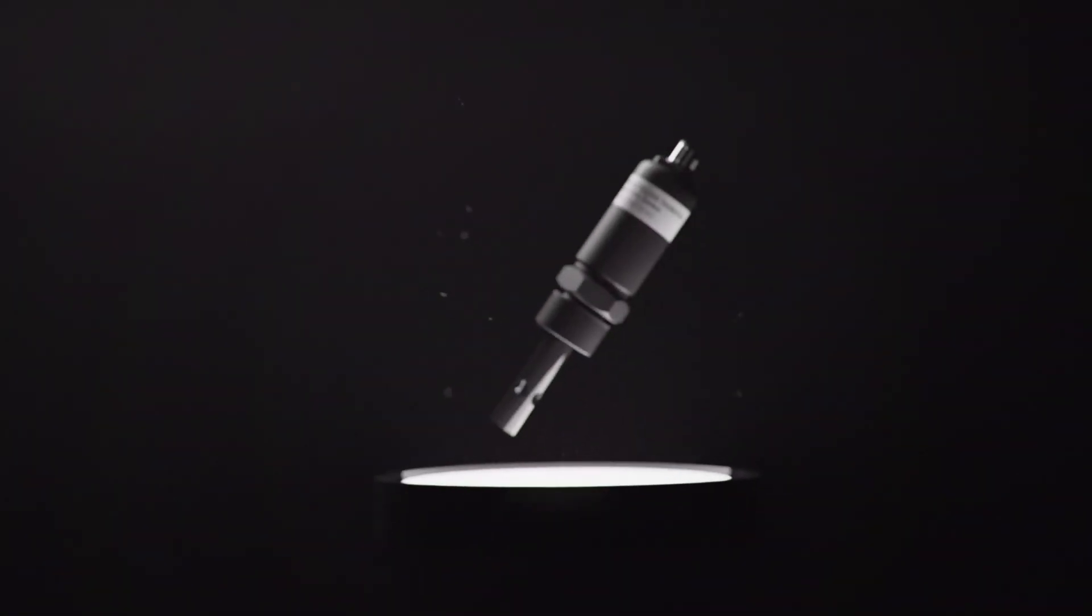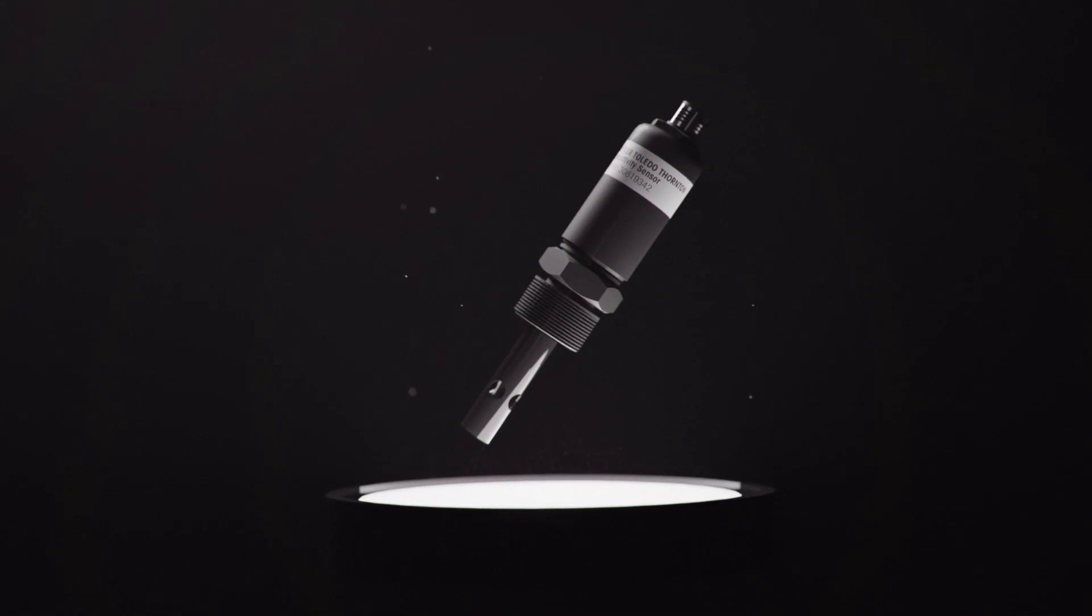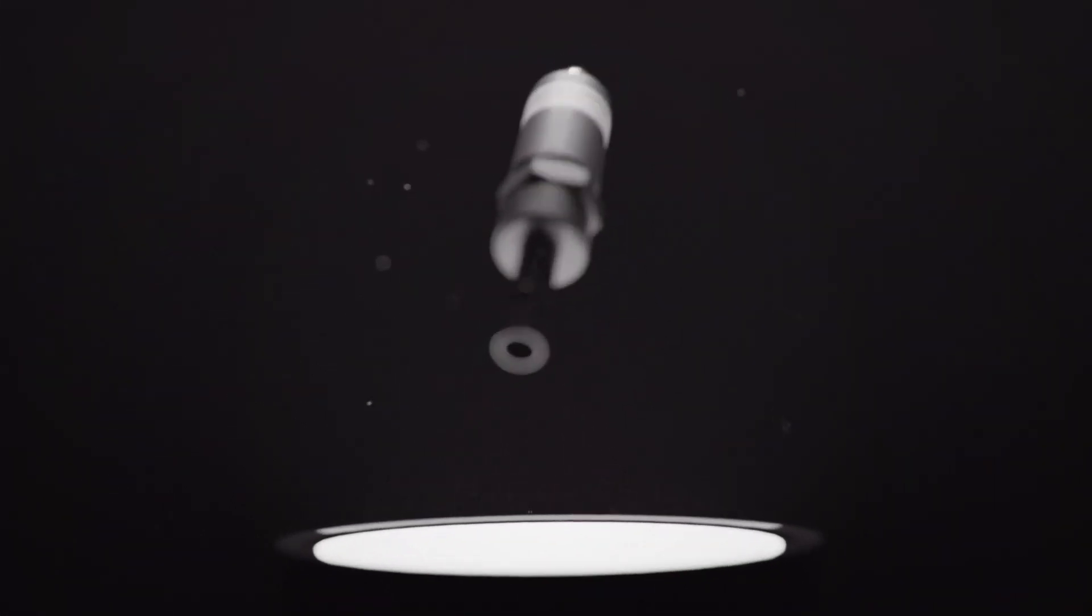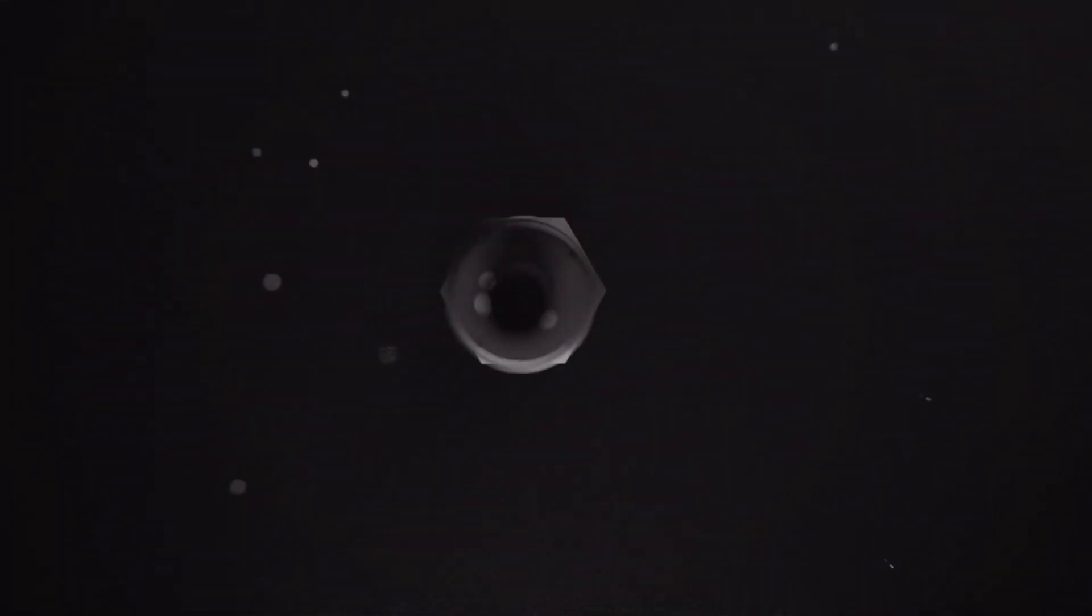Through close collaboration with industry partners, Mettler Toledo Thornton has developed the UPW Unicond.